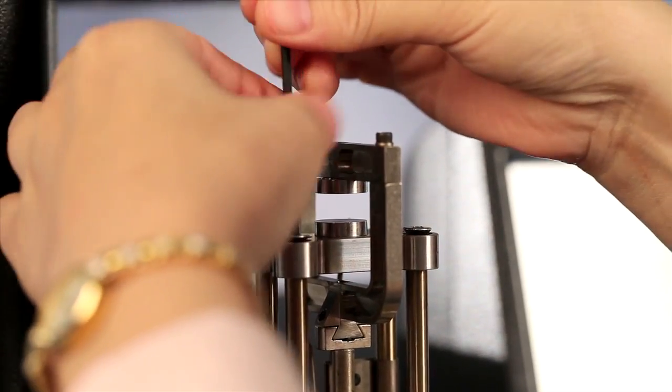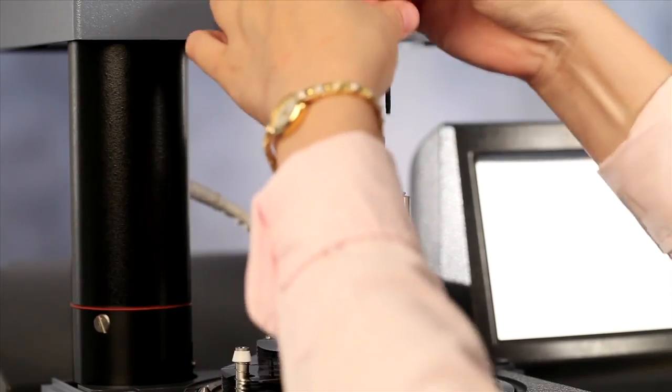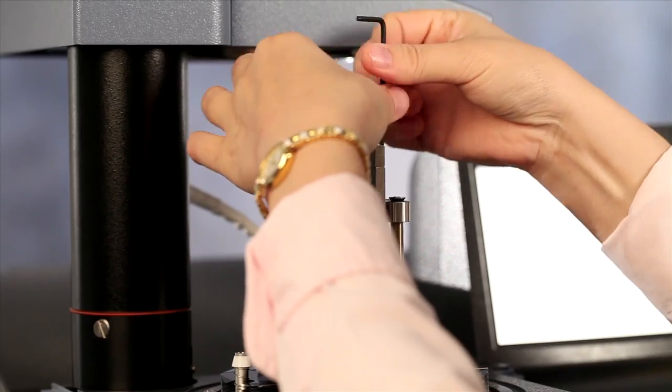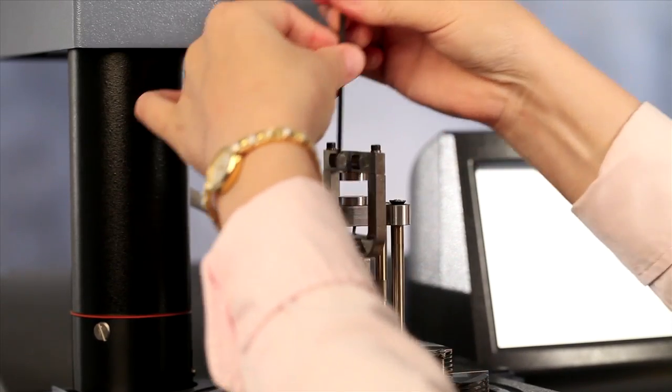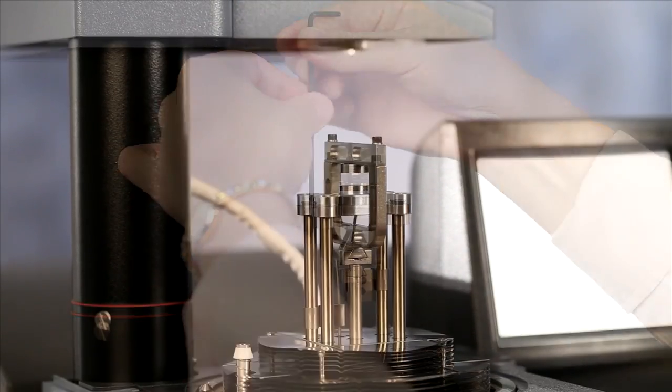Tighten all the screws with the Allen key that is provided in your clamp kit.